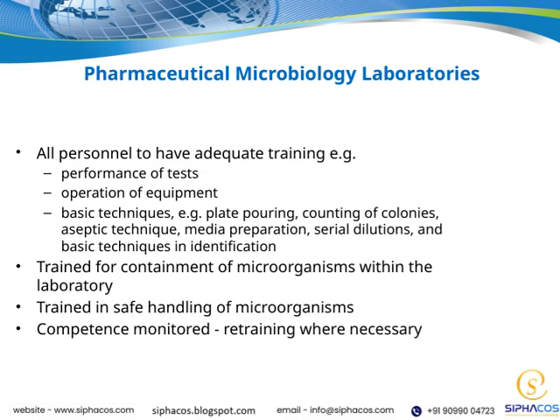Additionally, media preparation, serial dilutions, and identification techniques are vital for accurate microbiological analysis. Beyond technical skills, personnel need to be trained in containment procedures to prevent microorganisms from escaping the laboratory environment. Safe handling of microorganisms is equally important to protect both staff and the environment. To maintain high standards, competence is continuously monitored. If someone needs it, retraining is provided to keep skills sharp and ensure compliance with safety and quality protocols.